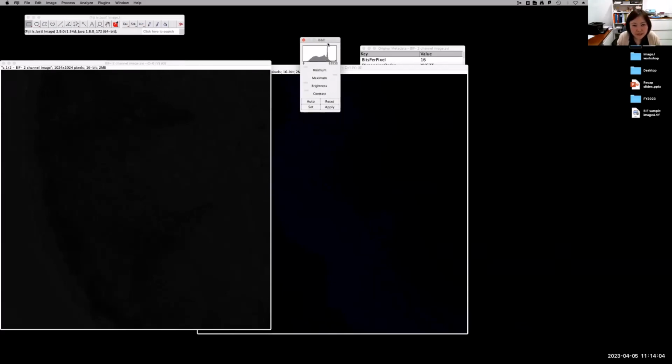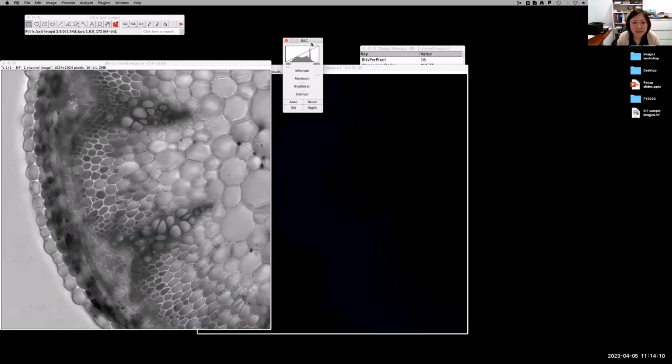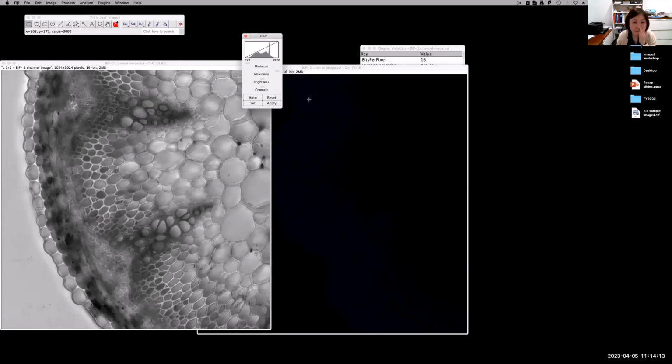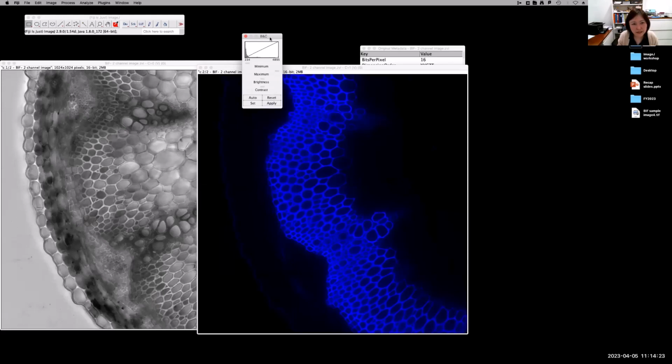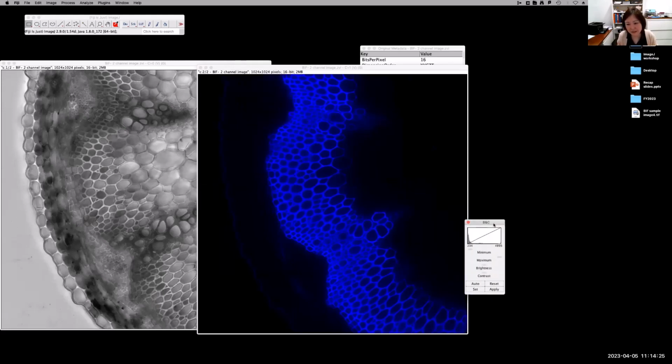If you have this screen, and you click reset, then you will see this image. The previous setting was, yeah, the brightness contrast slide bar at 0. So if I do reset, it should be showing this image on your computer.